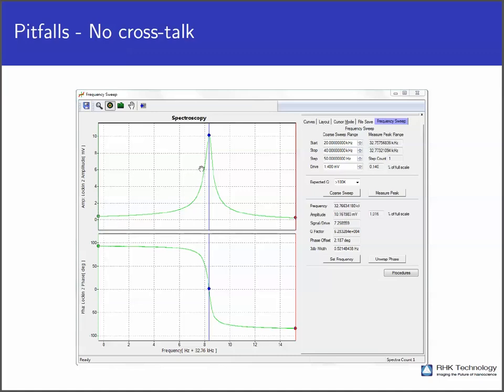Here, the crosstalk is way less than 10%, or this is not even crosstalk because we're quite close into the resonance of the cantilever. The amplitude you see here already has to do with the resonance of the cantilever, but this is less than 10% of the cantilever resonance, so this won't matter. We have a nice phase curve that goes from a little bit higher than 90 degrees to a little bit lower than minus 90 degrees. I've already explained that these are shifted artificially. So this is about 180-degree phase range from here down to here. This is a nice phase curve, everything looks right.